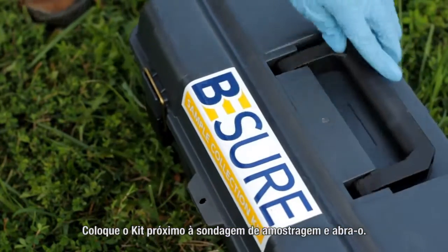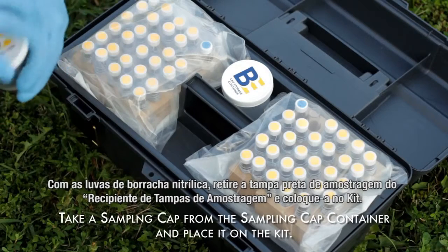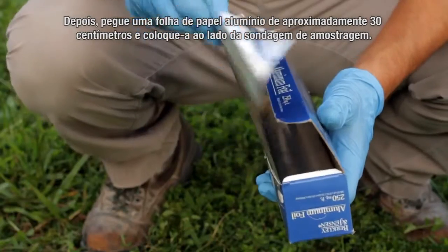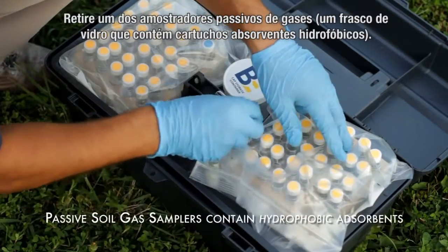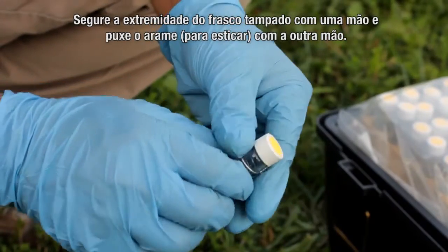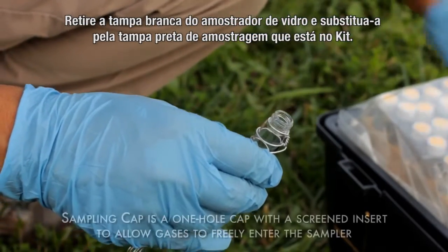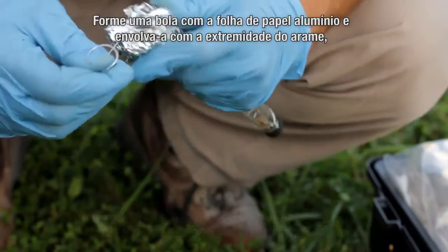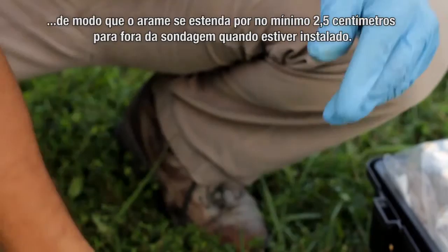Place the kit next to the sampling hole and open the kit. While wearing nitrile gloves, take a sampling cap from the sampling cap container and place the cap on the kit. Next, take an approximately 12 inch length of aluminum foil from the box and place it next to the sampling hole — this will be used to plug the hole. Remove one of the passive soil gas samplers, a glass vial containing hydrophobic adsorbent cartridges. Holding the cap end of the vial in one hand, pull the wire tight to straighten it with the other. Remove the solid shipping cap on the sampler vial and replace it with a sampling cap. Place the solid cap in the field kit. Form the aluminum foil into a ball and wrap the end of the wire one time around the aluminum foil so the end of the wire will extend at least one inch out of the hole when installed.